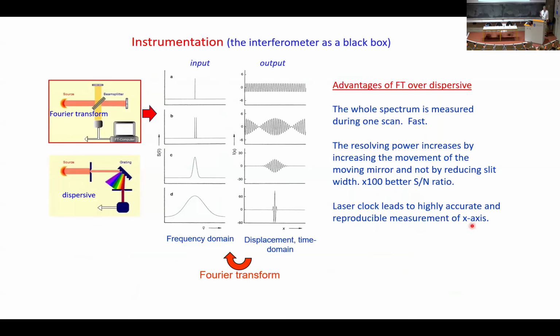Now, if I convince you that this is useful, then we can learn a little more about the instrumentation of an infrared spectrometer. Most people in most laboratories are using FT infrared, Fourier transform spectrometers. Now, for field work, there are traditional dispersive spectrometers, but this is relatively new. Dispersive spectrometers were the majority, were everywhere until the early 80s. Then they were superseded by Fourier transform ones, and now they're coming back, the dispersive ones, as field spectrometers.